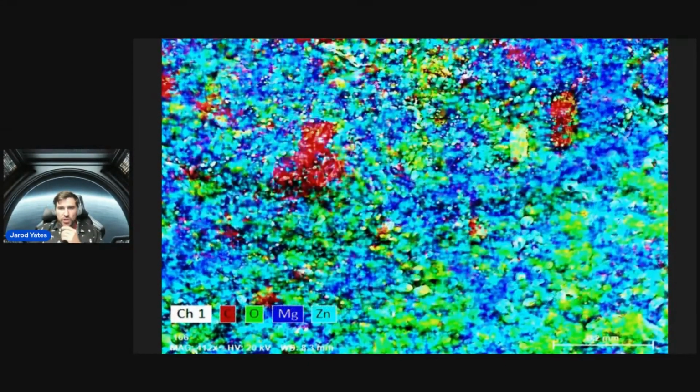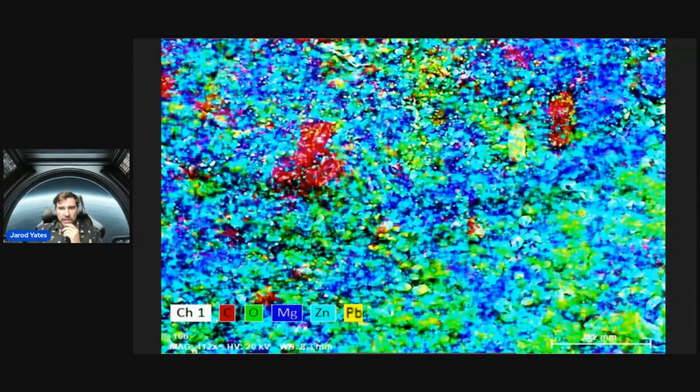and it's going to overlay them. One interesting thing here is this curve. I'll go back up. This curve here. You can see once again, we got that zinc with the lead poking out, but we have a structure, right? We have almost a half circle, half ring going on there. Anywhere where you see a circle or a line or a right angle, those are spots to pay closer attention to, because that suggests potentially purposeful manufacturing.